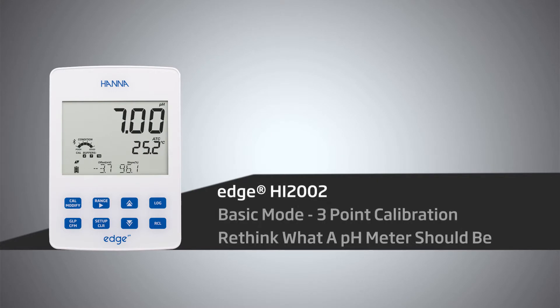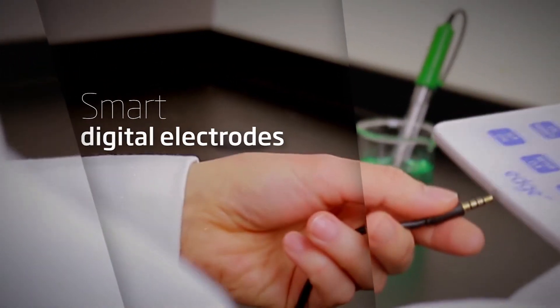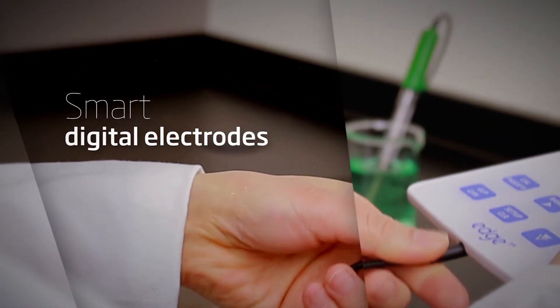Beautifully designed, this thin, lightweight meter offers the most accurate results at half the price. Paired with the Edge Smart Digital Electrodes, this portable pH meter will transform your lab. Hanna Instruments provides you with affordable and accurate equipment to help you achieve professional results.